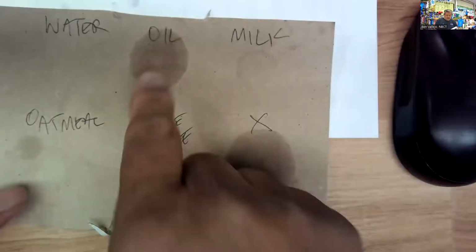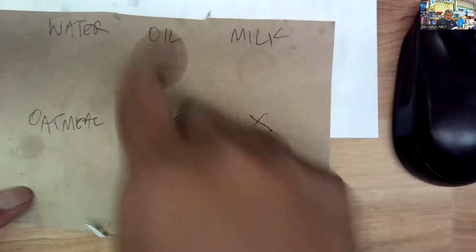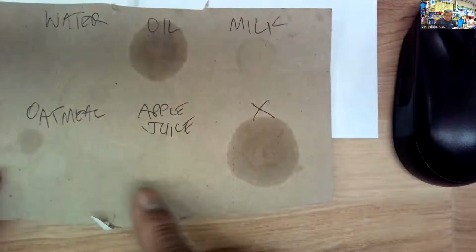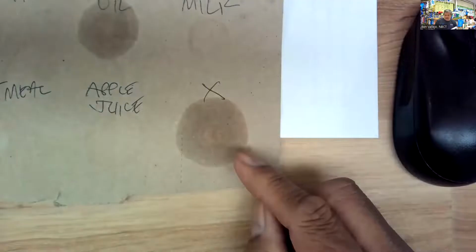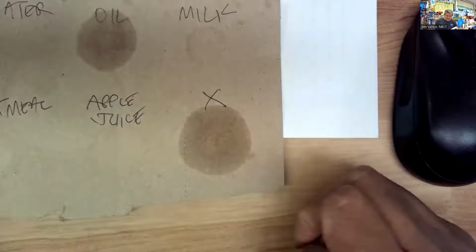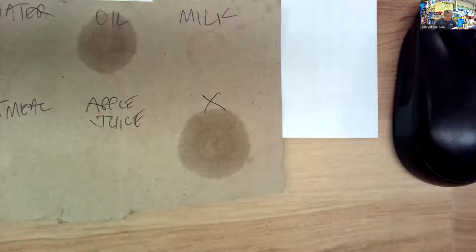that definitely the oil had a translucent grease spot, as well as the X. Water, milk, oatmeal, juice, they do not have a translucent spot. It completely dried out. And this X right here means that in my particular mix of X today, the oil can be found as part of the unknown X. All right.